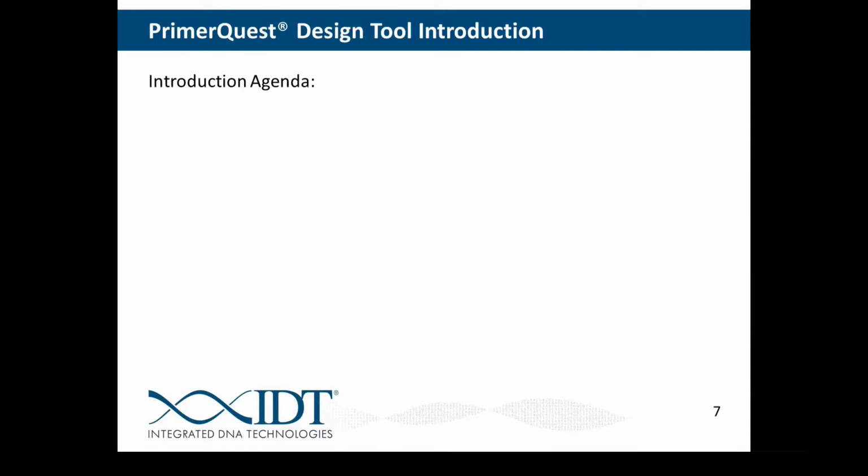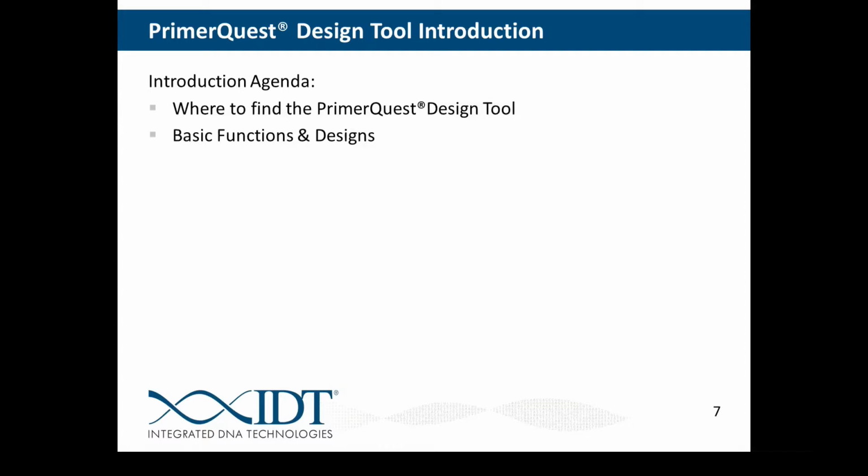So let's get started with a brief introduction to the PrimerQuest tool. Like I mentioned, we recently revamped the tool, which included some back-end engine design as well as improving the user interface. So during this section, we'll discuss where we can find PrimerQuest, which I already kind of went over, some of its basic functions and designs, as well as navigating the results page.